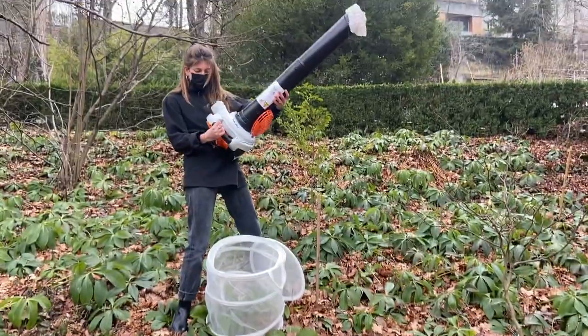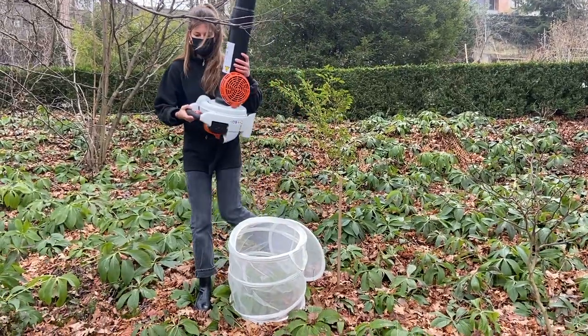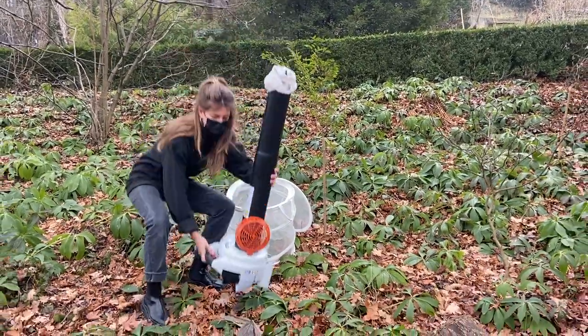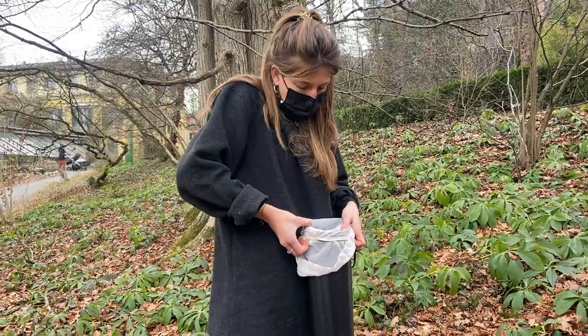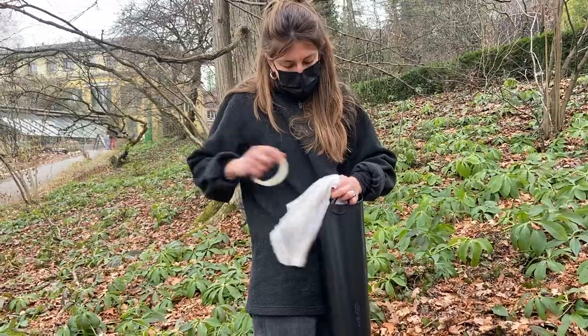Lift the leaf blower while it is still running vertically out of the net and hold it upright while you turn it off. Quickly place the leaf blower on the ground and quickly remove the mesh bag with the insects inside so that none escape.